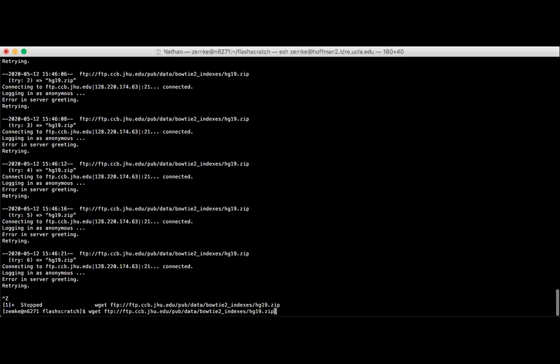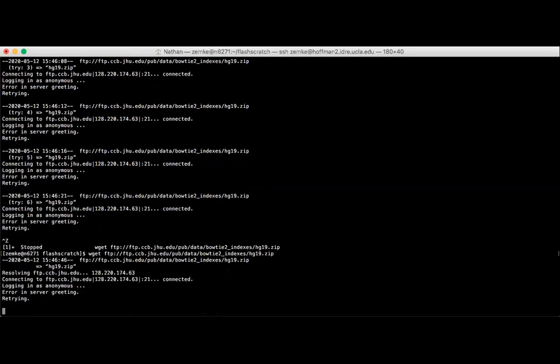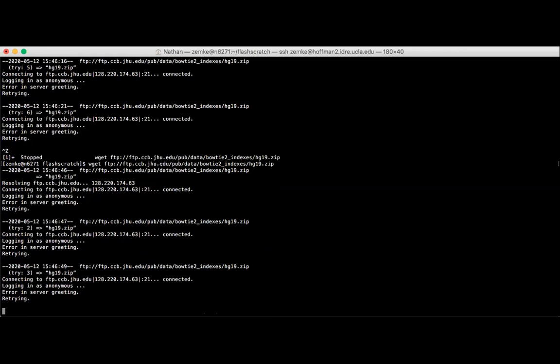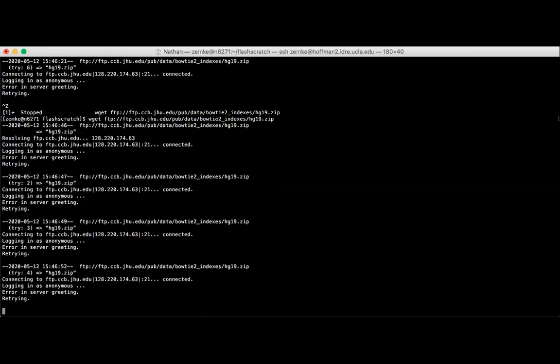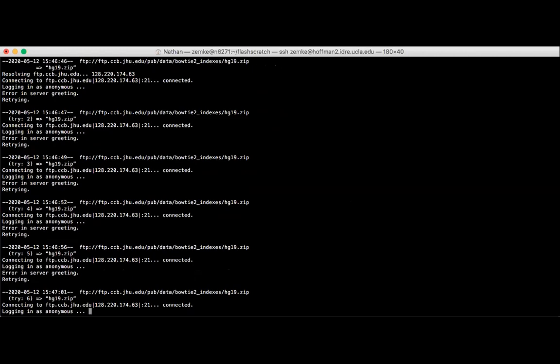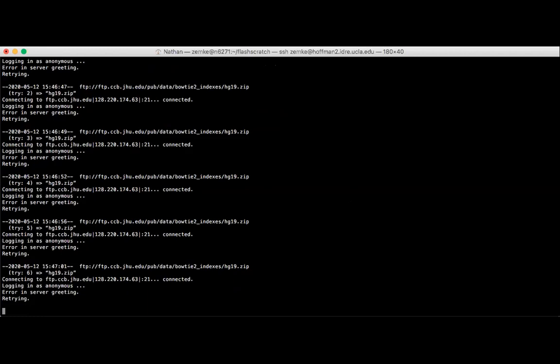So I'm going to copy and paste it. Error. Well, I've never seen that before.